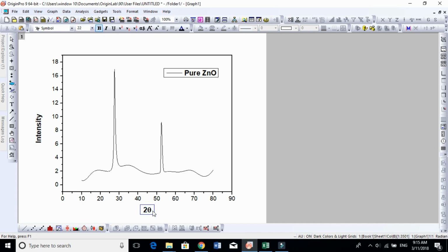And one thing more: if you want to put a symbol, for instance alpha, we usually use A. So select this. Don't change the font style, just come to this bar, and you see, click this one, and it will give you the alpha symbol, right? This is how we bring in symbols.